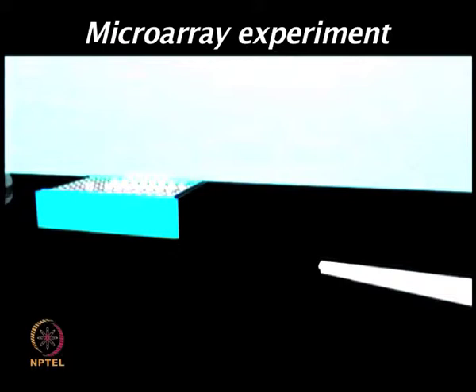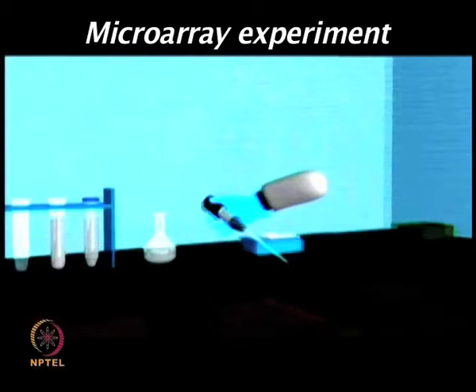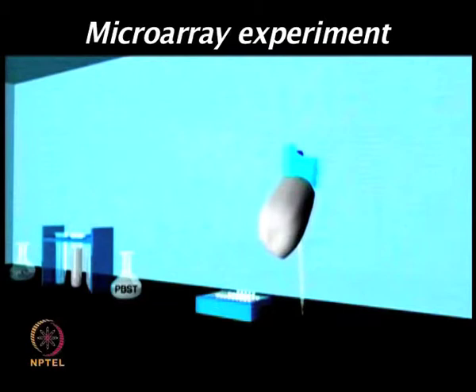But different investigators use different strategies for identifying the signals. For example, your secondary antibody could be conjugated with HRP-based systems. If that is the case, then one can even use a tyramide signal amplification system. The TSA reagent is a tyramide molecule which is linked to a label.